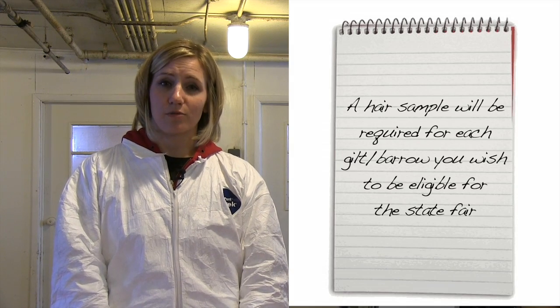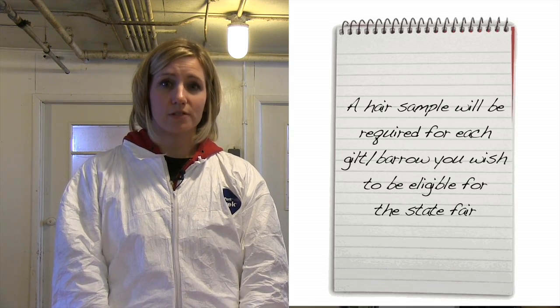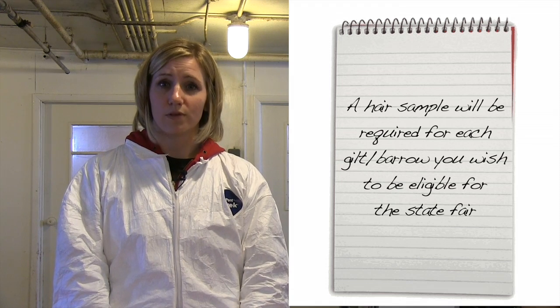Hi, I'm Dr. Kara Stewart from Purdue University. The purpose of this video today is to properly demonstrate how to collect the hair sample for your 4-H swine project. A DNA hair sample will be required for every gilt and barrow that you want to enroll in the state fair.